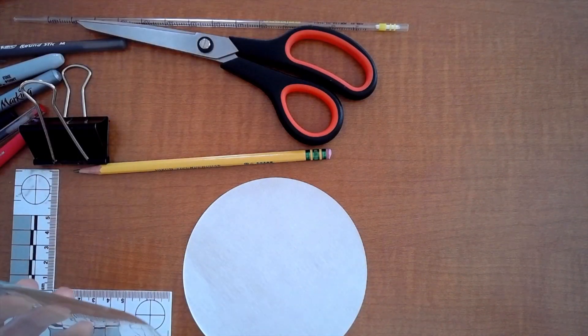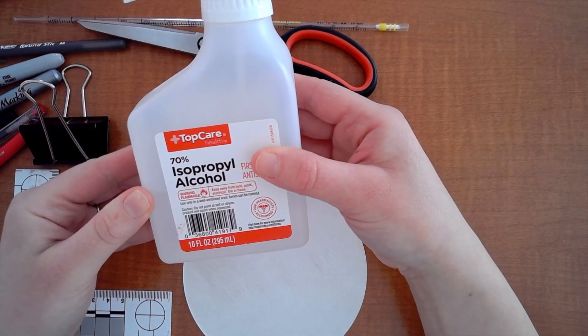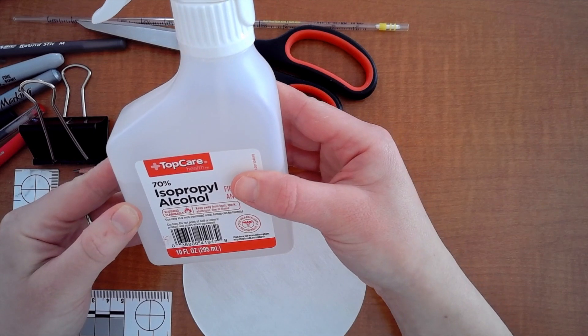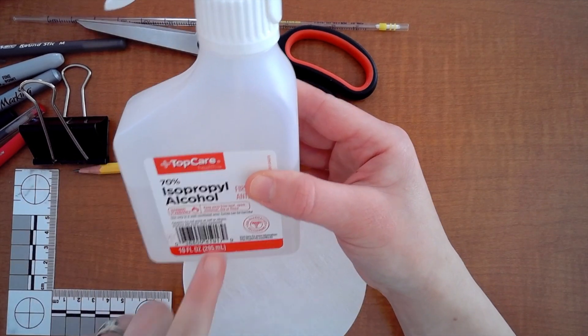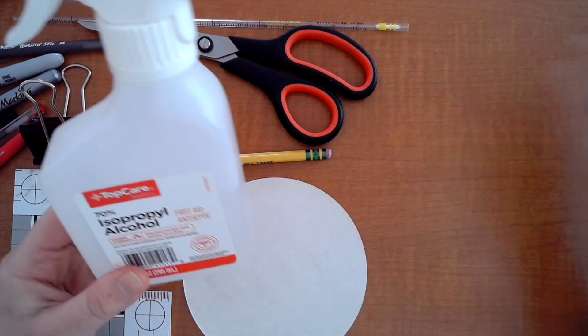You will also need one of the beakers provided in class along with some 70% isopropyl alcohol which will also be in class and you will have to share. So you'll need about 150 milliliters when you get to this. So let's start prepping this right now.